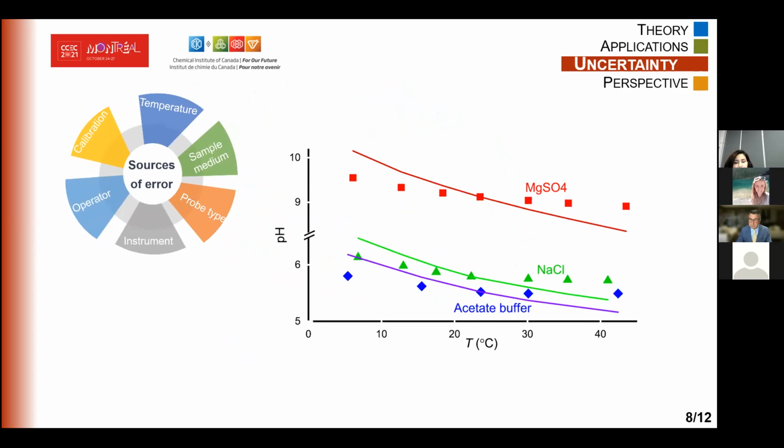As you can see, the pH decreases as the temperature increases, which confirms the Nernst equation. The temperature has 2 main effects on pH. One is the change of equilibrium and dissociation of hydrogen ions, and the second is on the voltage that is induced by the pH sensor. So as we get further from the calibration temperature, the error increases.